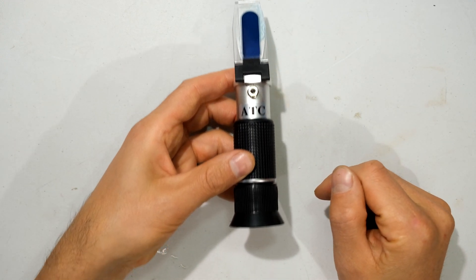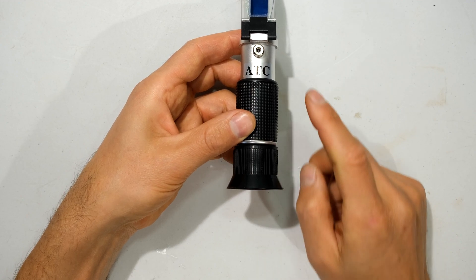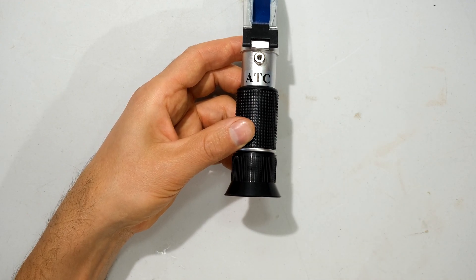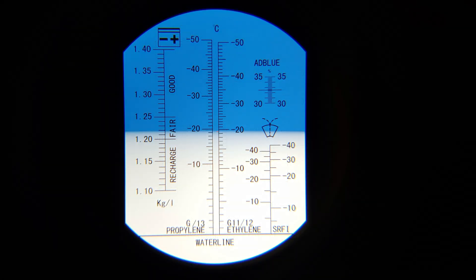After you've waited 30 seconds, you can now look through the viewfinder and you will see a scale. Looking at the ethylene glycol scale, we can see that the solution is at about minus 19.5 degrees centigrade. This scale is the ethylene glycol scale.